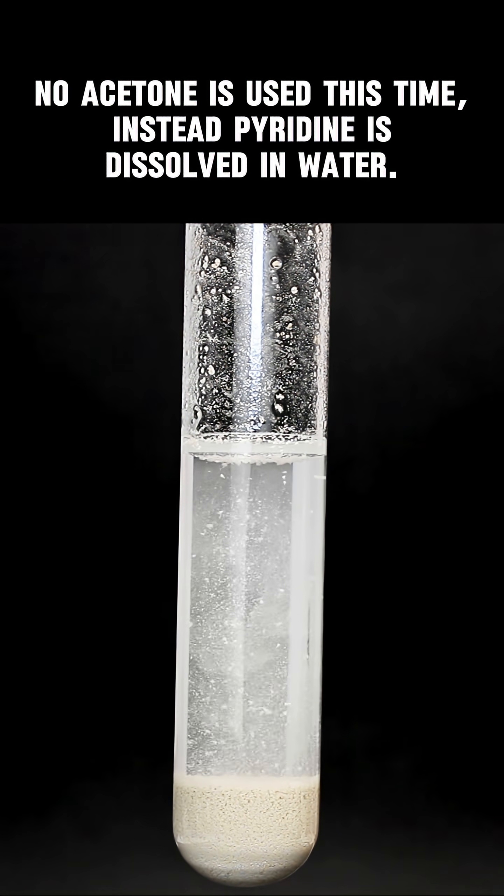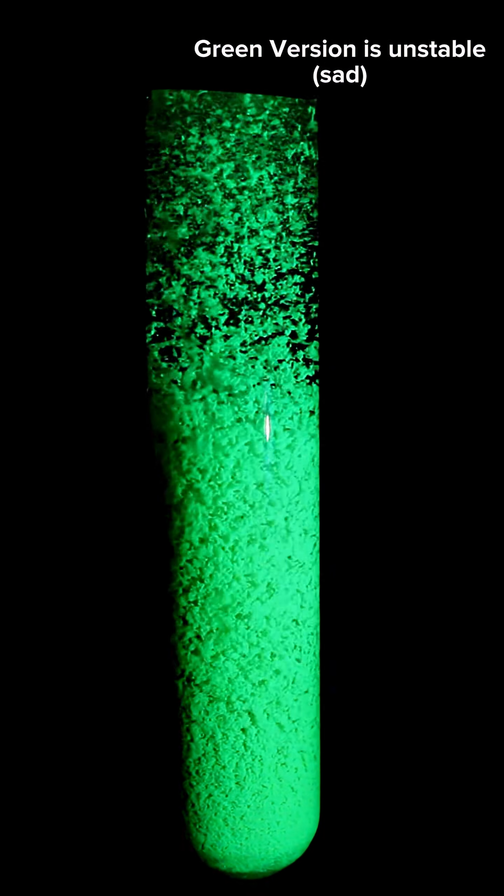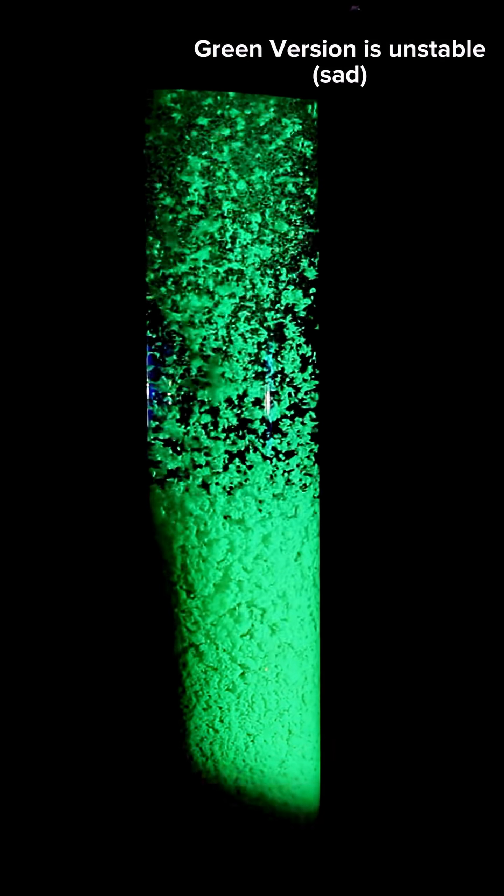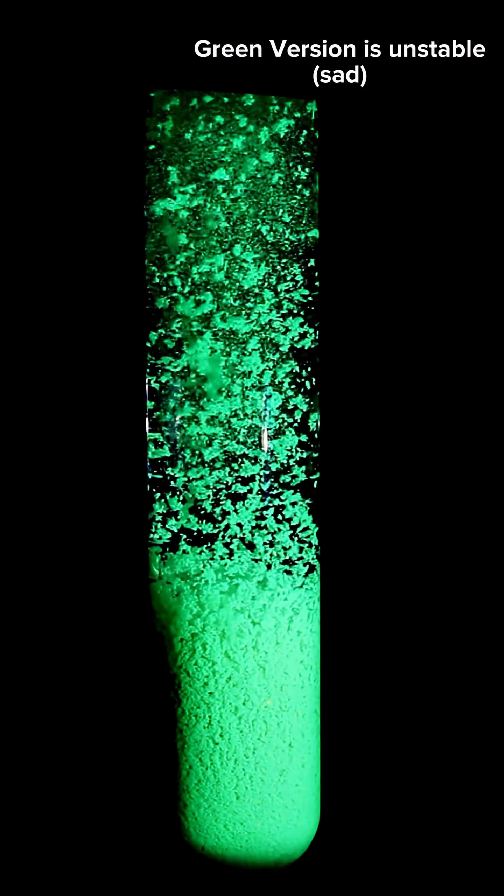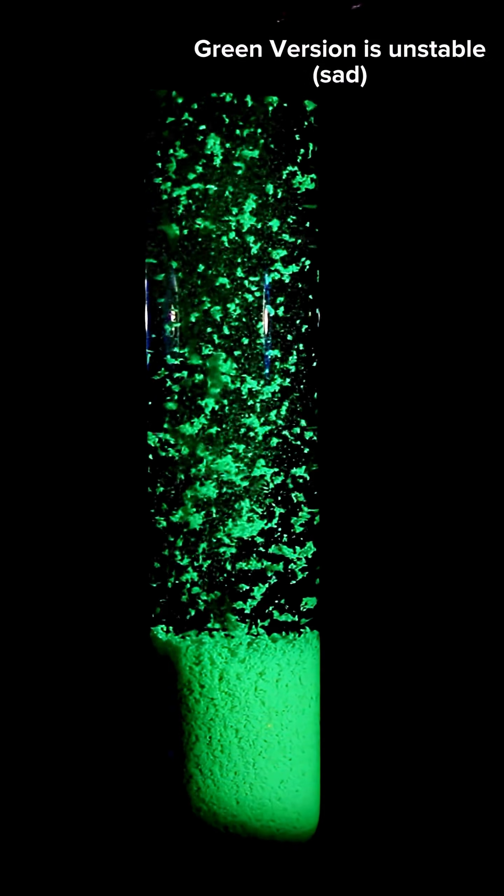I don't really know what this complex would look like as I can't find any literature on it, but as I mentioned earlier it's not really stable. I've had good luck storing it in an ampoule, but otherwise the green variant will slowly lose pyridine and become the yellow variant over time.